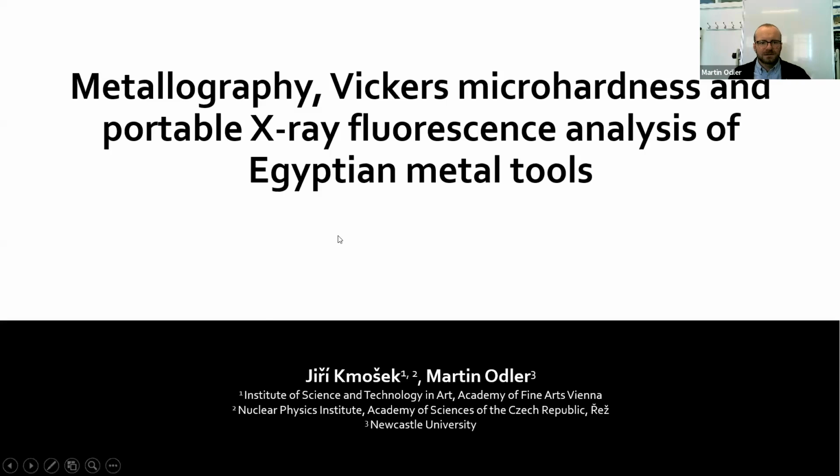And in this talk today, he would like to tell you more about some specific archaeometallurgical methods that can provide us information about the production technologies and also practical possibilities of the tool use. And he will be focusing especially on metallography, Vickers microhardness, and portable X-ray fluorescence.